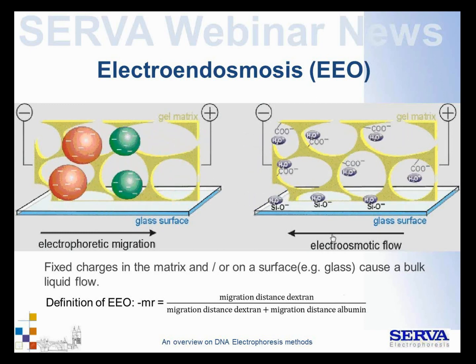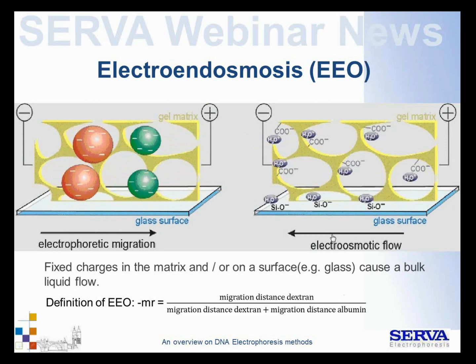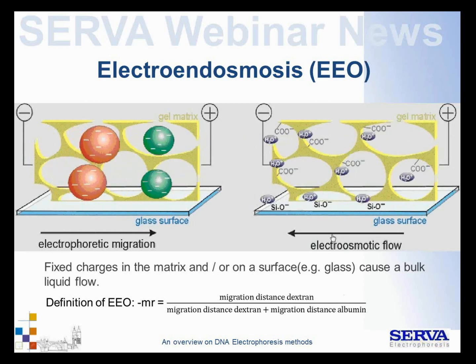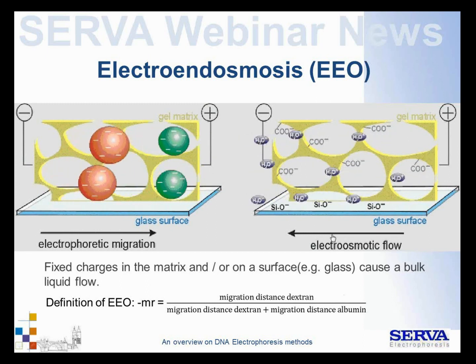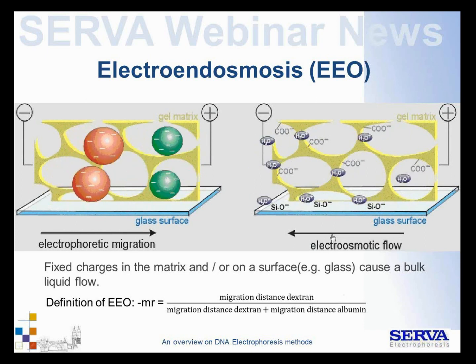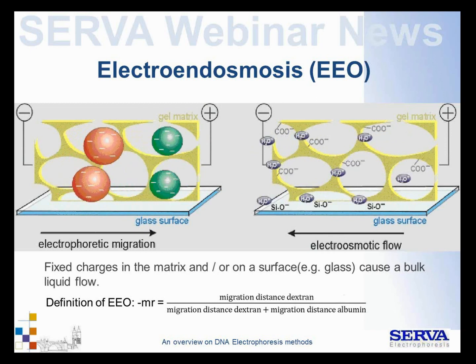That's why the boxes for agarose electrophoresis for nucleic acid separations are so-called submarine boxes, where you have the gel submerged below the buffer surface. So you cannot see the water flow, because the water flows towards the cathode but will reflow to the anode, because it's all under water.